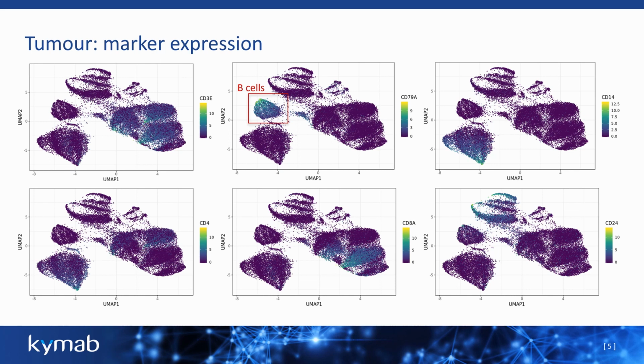There is quite a sizable component of B cells in lungs in general and in lung tumors. Again, we've got the myeloid cell component. These cells express CD14, so they'll be your classical monocytes or your classically derived macrophages. If we drill down again a bit more, we've got CD4 cells here. We've got CD8 cells. And then I just basically looked at a marker that is known to be expressed in lung epithelial cells and is known to be upregulated in tumor cells from lung epithelial cells.